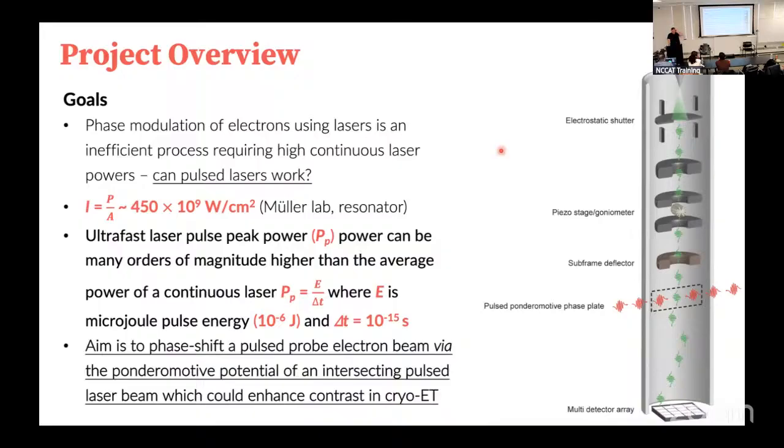Yes? Yeah, so I guess I don't understand the nanometer. So we try to collect the elastically scattered electrons, right? Not the one that 80% comes. That's right. So you try to interfere with those only, right? Yep, exactly. Perpendicular to the. Yep. You're trying to change the behavior between the elastic and the inelastically scattered electrons. Yes, that's right. So how do you avoid the one that 80% transmit through and just focus on the one that is elastically scattered?